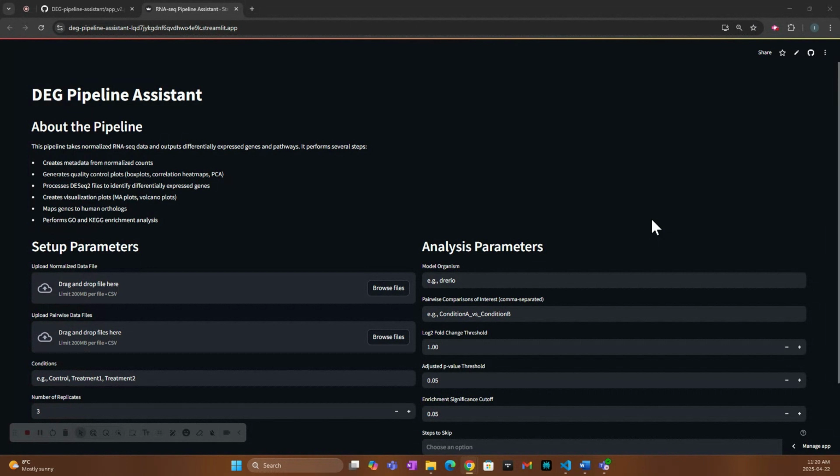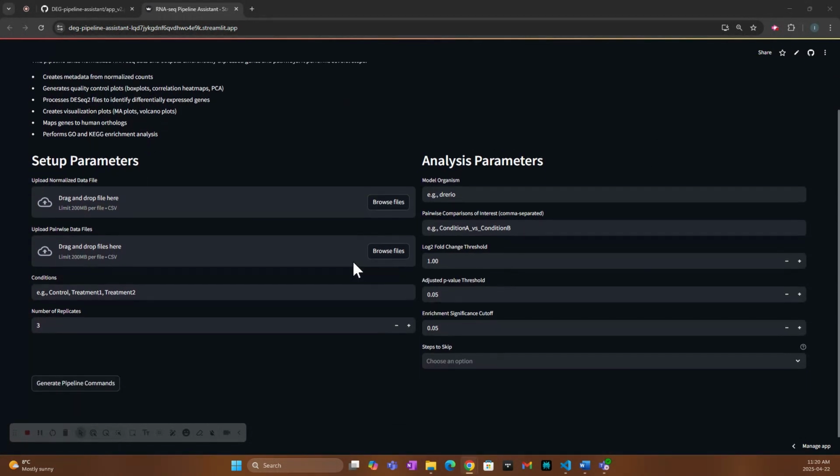RNA sequencing is a common method used in preclinical trials, so testing on model organisms before moving on to humans. Companies who outsource the sequencing job to a third-party lab run into a bottleneck when they reach the downstream bioinformatics analysis after receiving the initial data from the lab. And so I developed this app with Canurta's bioinformatics team in order to better automate this process. So now let me show you how someone would actually use this pipeline.